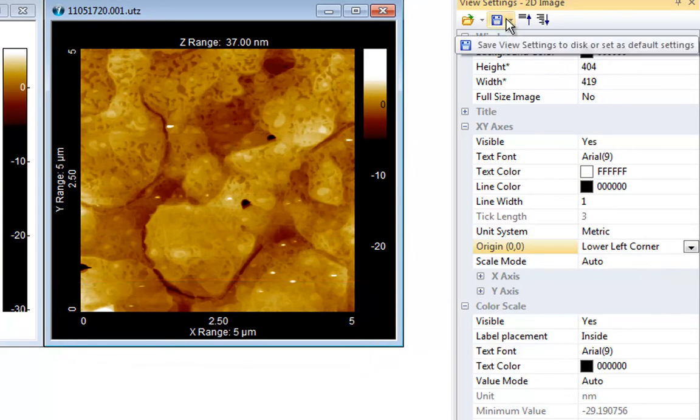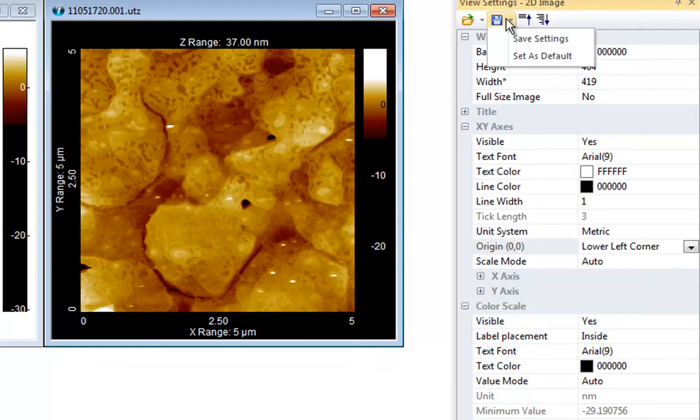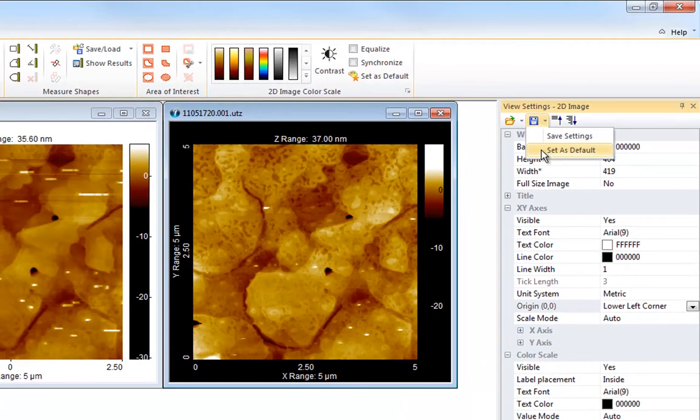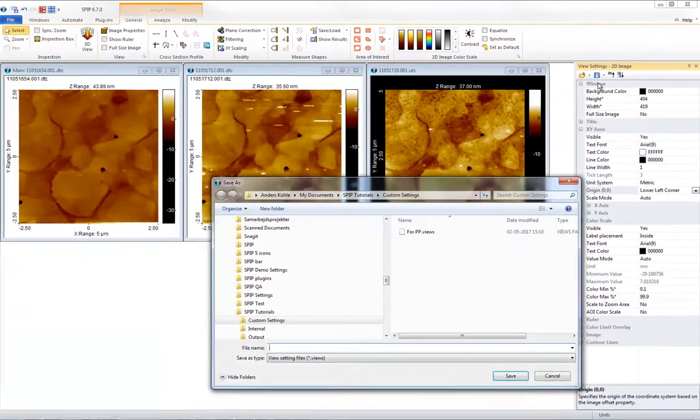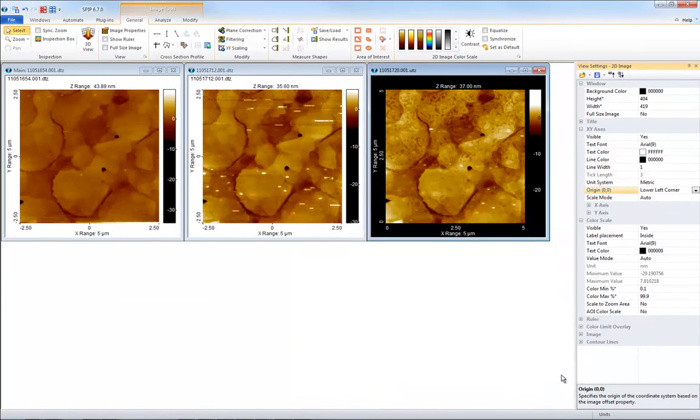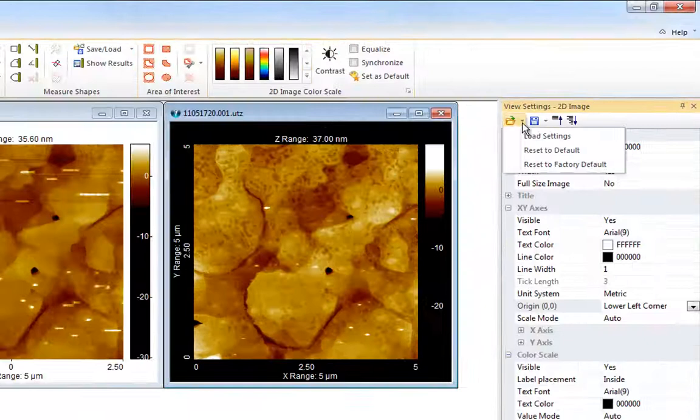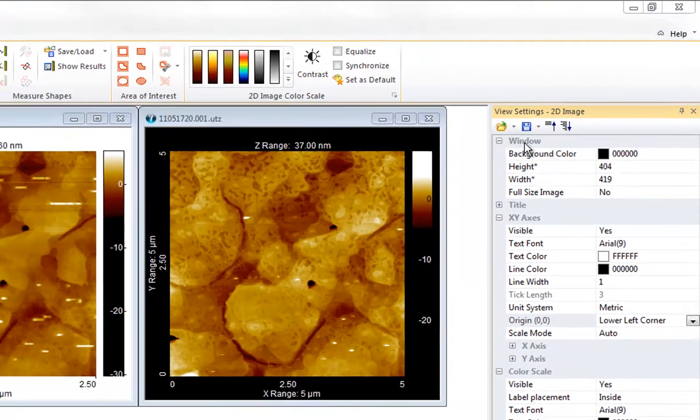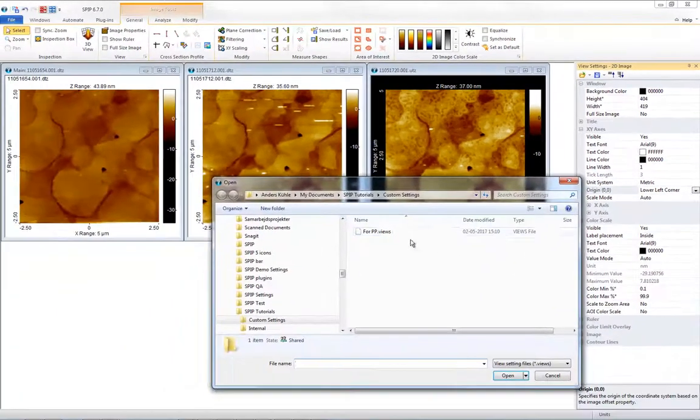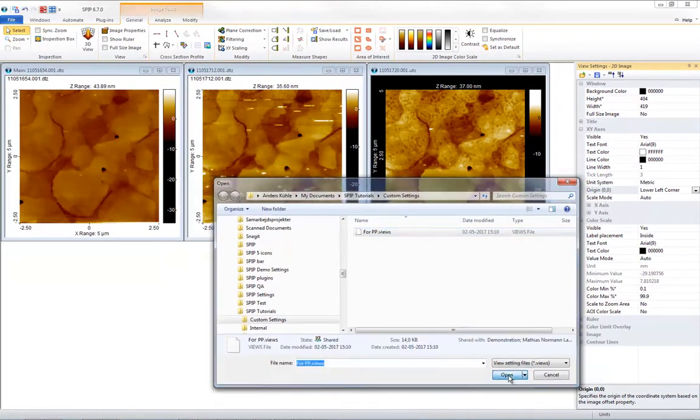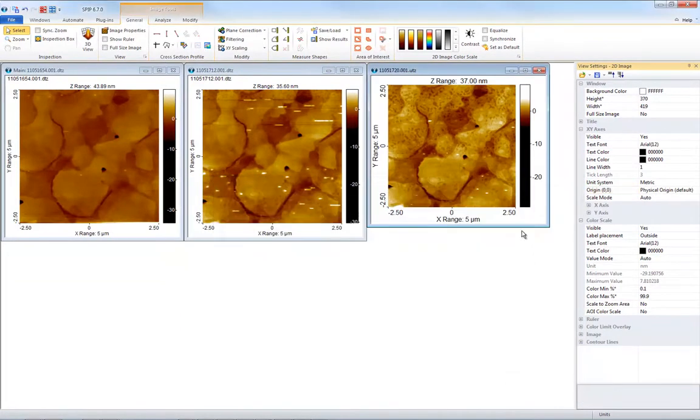Like with the color scale you can make the current view settings your default. Just push the save button in the toolbar and click set as default. Select save settings to preserve a combination of view settings for later use, for example for a paper or a poster or a PowerPoint presentation. Click the open button to reopen saved settings at a later time or to reopen the factory defaults.